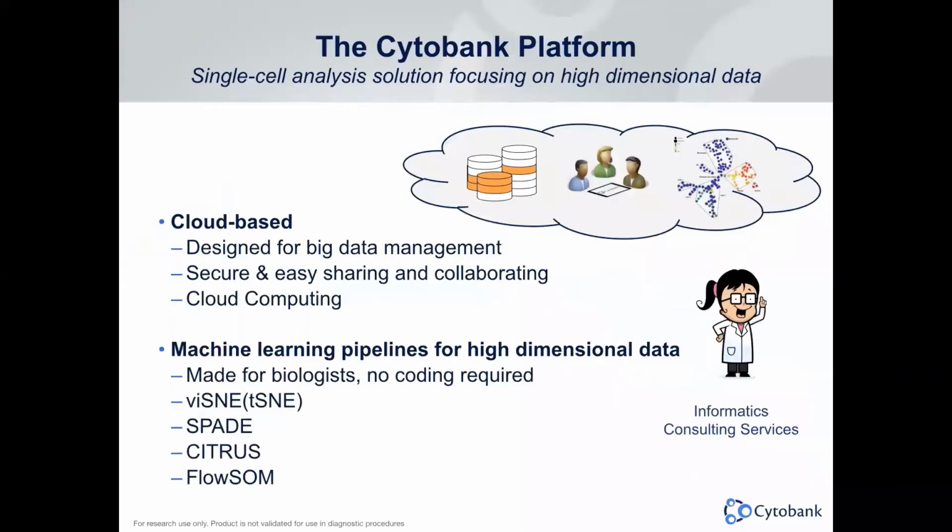Cytobank, as a cloud-based platform, is specialized in single-cell analysis solutions for high-dimensional data, leveraging the power of cloud compute for machine learning algorithms. We offer structured content management where you can securely save and archive your analysis. You can collaborate and share easily with your colleagues via a share button. The platform is designed for biologists with a friendly user interface. We also offer professional bioinformatic consulting services for customized work.